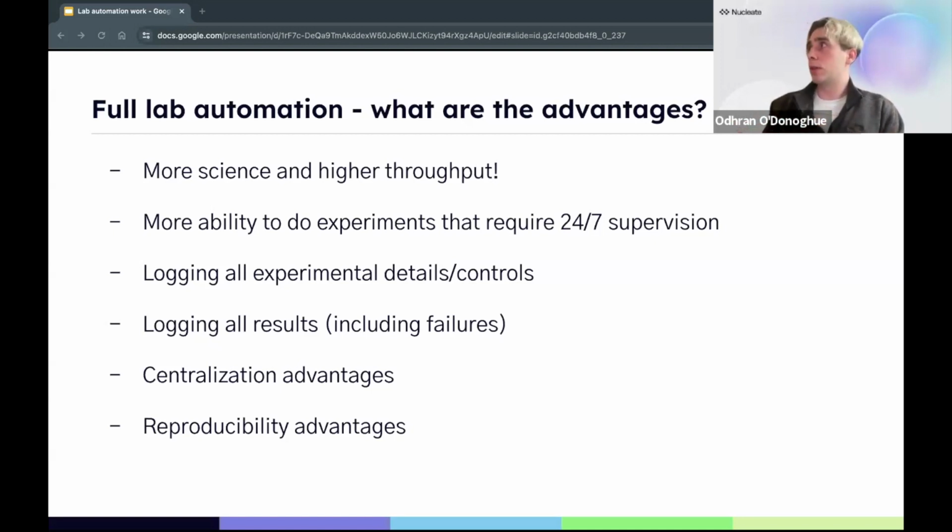Of course, if we're doing this all in one place with one big automation facility, we also get the advantages of having all this data in the same format, all of these experiments running on the same machines. We, in theory, get some ability to learn more from that. Similarly, if kit is standardized for automation, there's potentially advantages for reproducibility. That's maybe a little more.